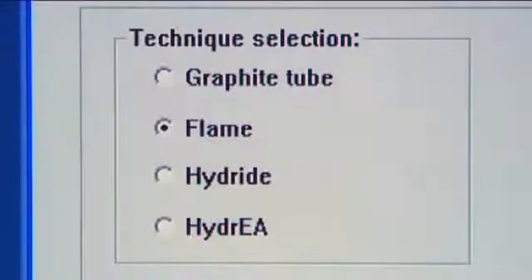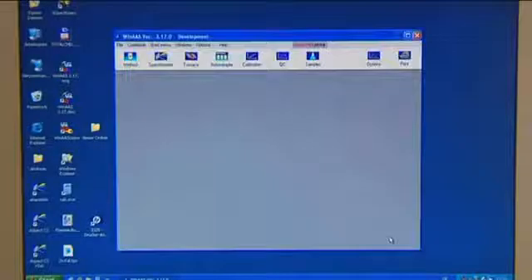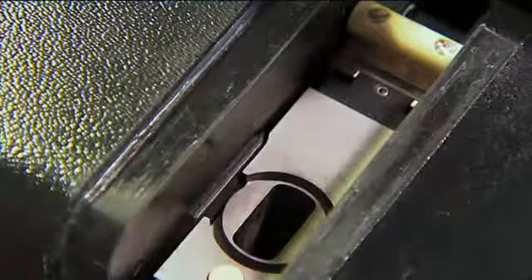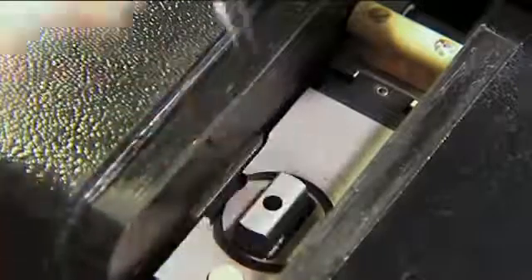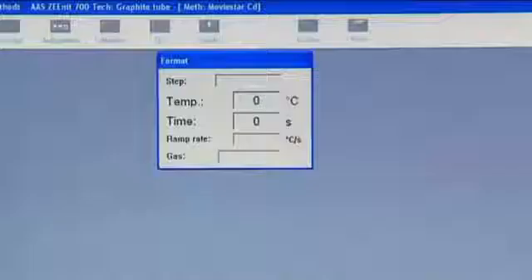Changing over between the flame technique and the graphite furnace technique involves only a mouse click. All instrument settings are software controlled. Due to the mature design there is no need for any expensive adjustments. Before a measurement series is started and while the furnace is being exchanged, the temperature of the graphite furnace is measured and corrected during a forming routine, ensuring reproducible atomizing conditions over the whole service life of the furnace.